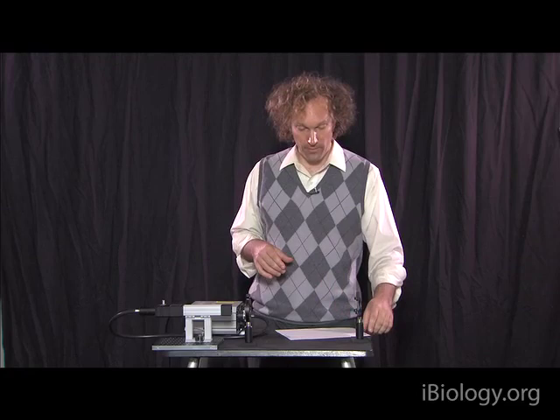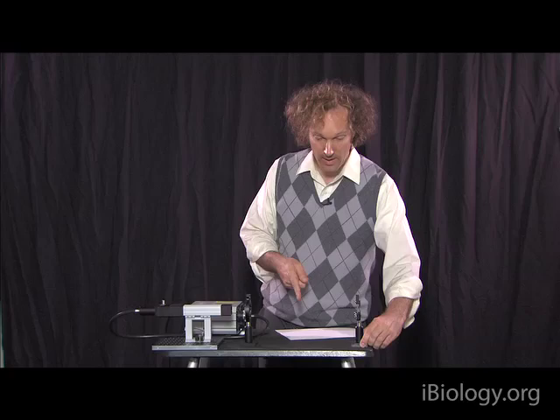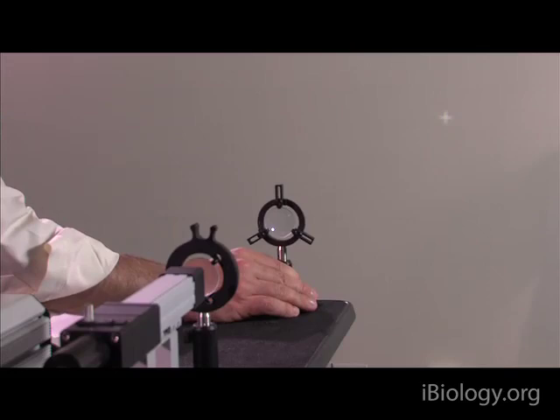Now, we also know that you can put lenses together and increase the magnification or change the location of images. So what if we add a second lens to that system? So we've taken an object, we've created an image. If we add another lens, we should be able to use this as the object and create an image. So if we look on the wall, and if we adjust the position of this lens, we've now created an imaging system where I have a two-lens system.